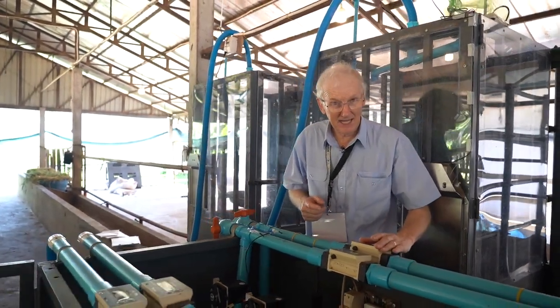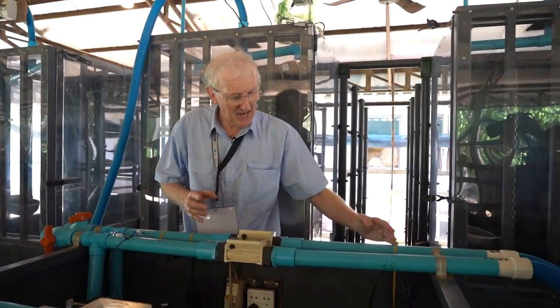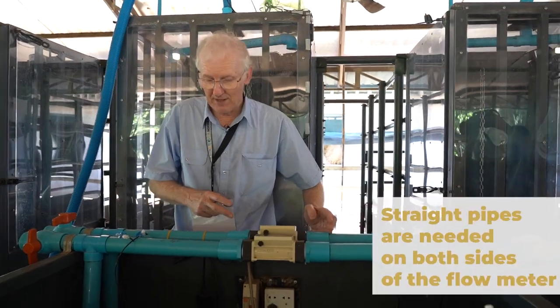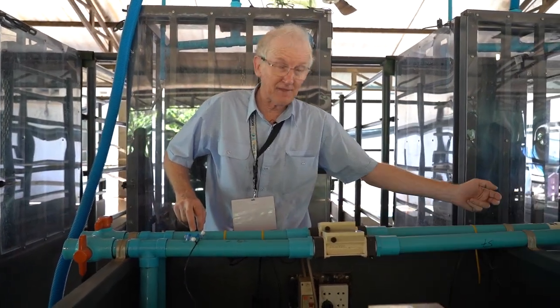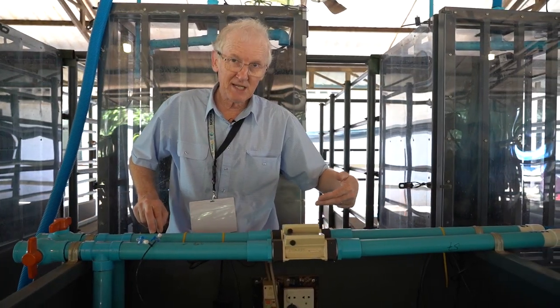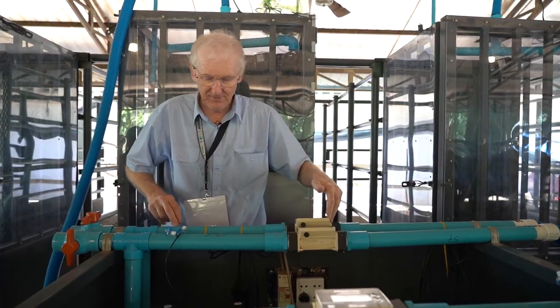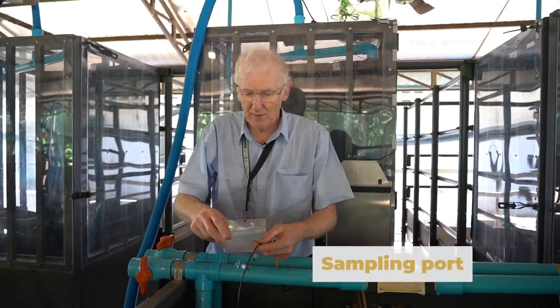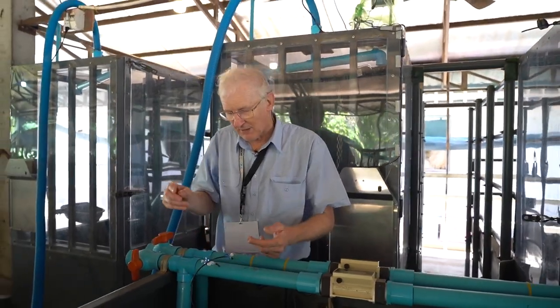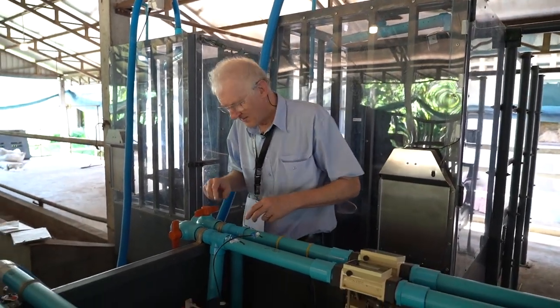When you put a flow meter in, it does not matter what sort of flow meter, you need to have a straight portion of pipe in front of it and a straight portion of pipe coming away from it, so that the flow is linear. All of these things require pretty linear flow to rightly estimate airflow. We have a sampling port here. That is where we are going to collect our subsample of gas, and I'll come back to that in a minute.